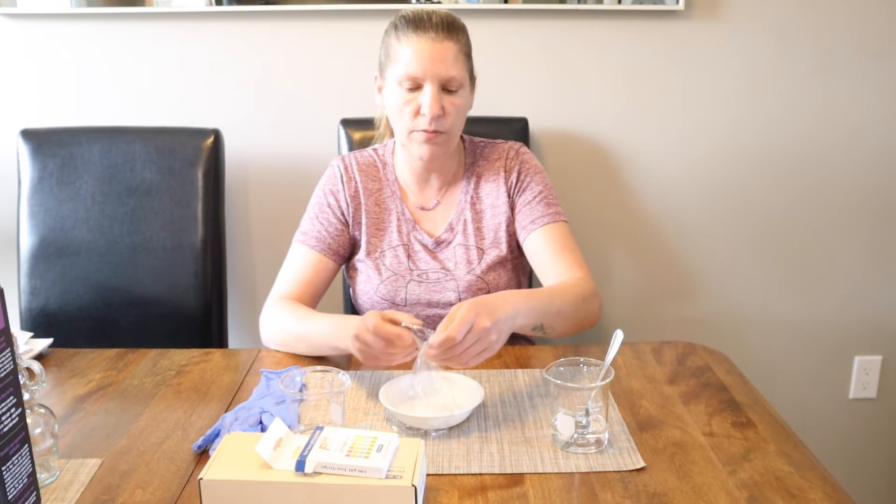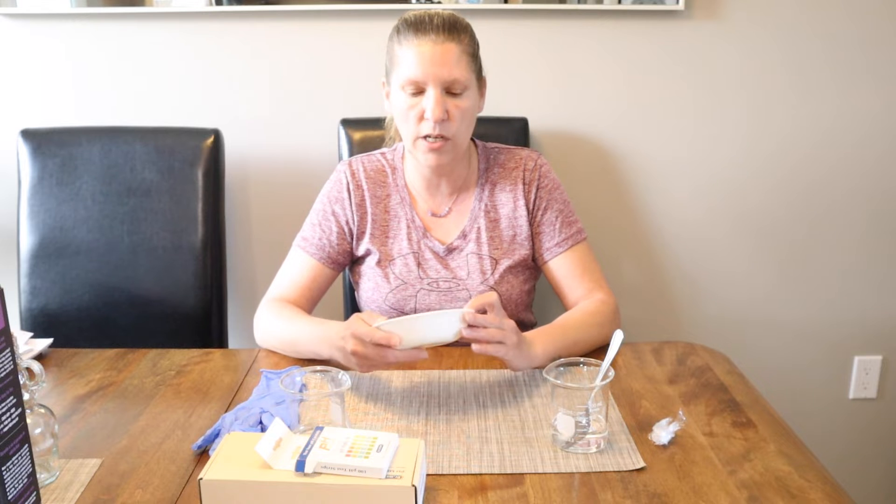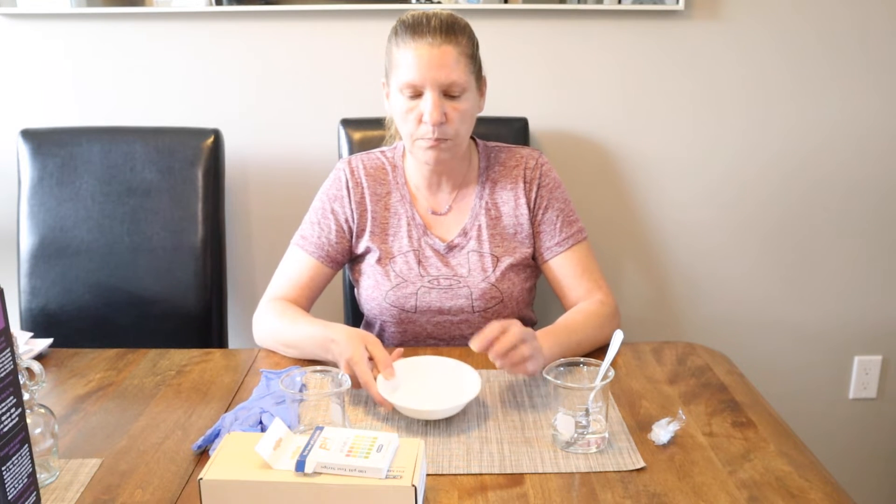That's why we do stability testing — I do have a video about that as well. Once you have your finished product and you're happy with it, take the pH of that specific product. For example, I have a lotion in this dish here, and we want it to be at about 5.5. This is actually a store-bought lotion that I'm going to test and play with today to show you how to lower and how to raise pH.